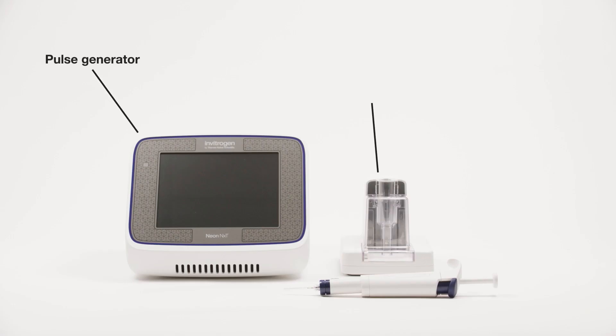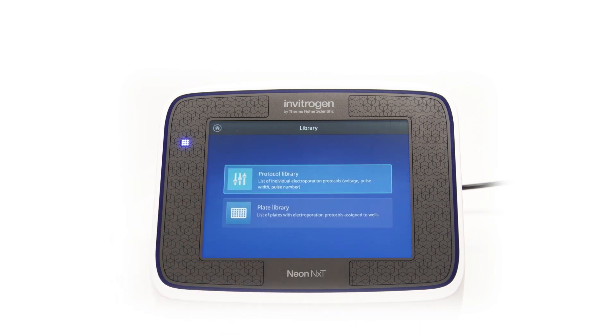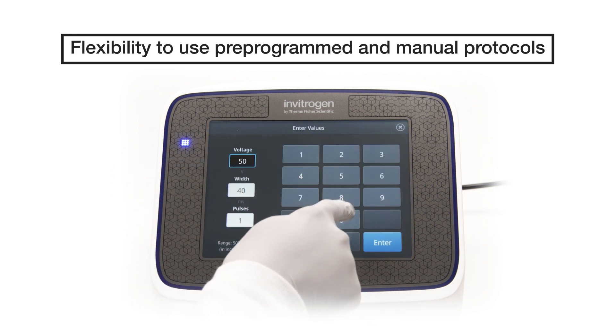There are three main components of the NeonNext Electroporation System. The first component is the NeonNext Pulse Generator Device itself, which has a touchscreen and an easy-to-use interface. The device comes pre-programmed with pre-optimized protocols that can be modified and stored as your own.